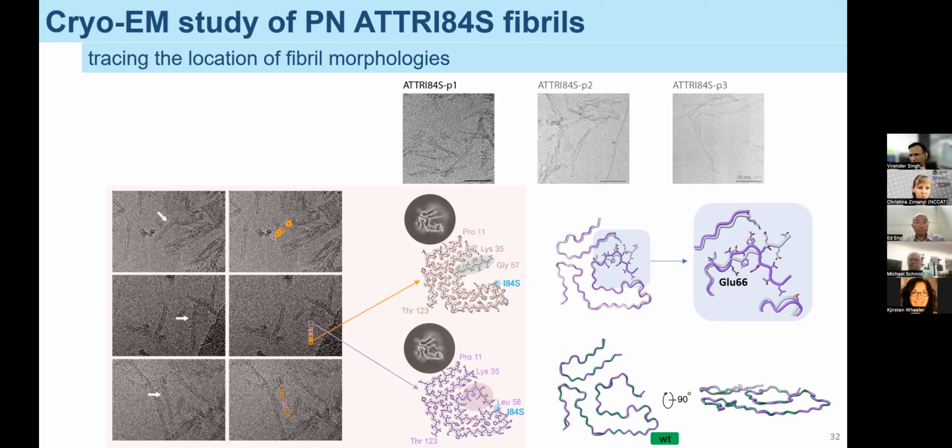Again, we think that the loss of isoleucine to serine is leading to this open conformation. But as you mentioned, it is possible that there are still some interactions which might be keeping it in equilibrium. Maybe solving more structures, or reaching a resolution of maybe 2.3 or 2.2 angstrom, might give an answer to what you are asking at this point. Yeah, great, a little higher resolution to let you distinguish isoleucine from serine. Yeah, that'd be great.